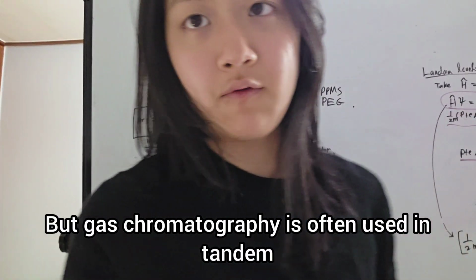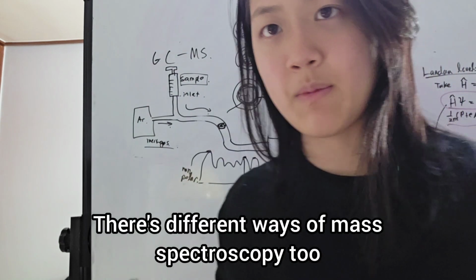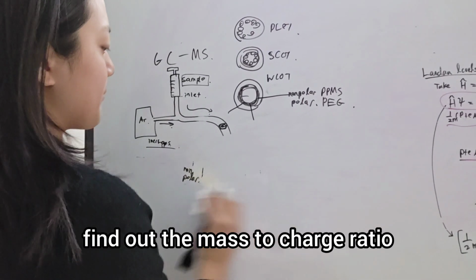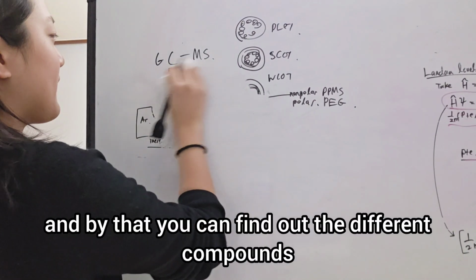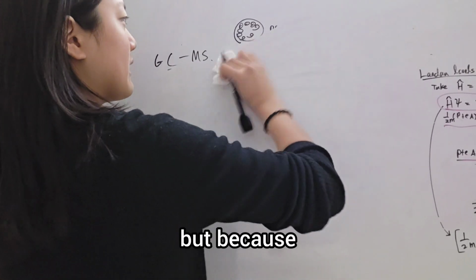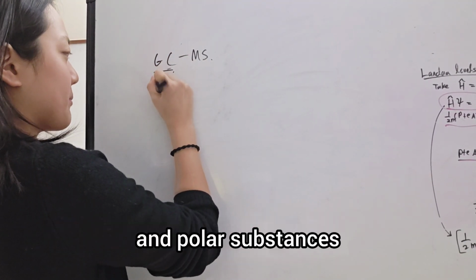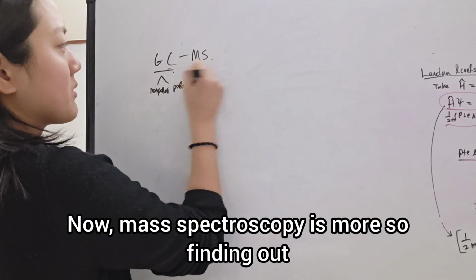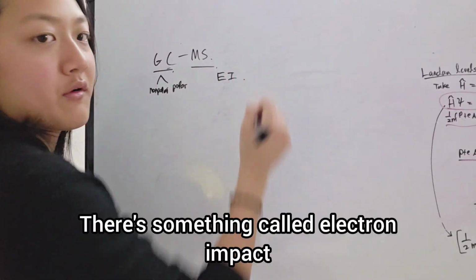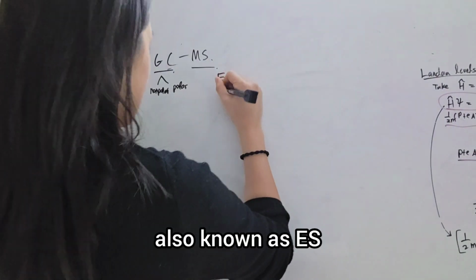But gas chromatography is often used in tandem with the mass spectroscopy. There's different ways of mass spectroscopy too. So mass spectroscopy is basically used to find out the mass to charge ratio. And by that, you can find out the different compounds that are within it. Not just the non-polar versus polar, because gas chromatography is basically used to separate non-polar and polar substances. Now, mass spectroscopy is more so finding out what each of those substances are. There's two main techniques I would like to compare. There's something called electron impact, also known as EI, and there's also electron spray, also known as ES.